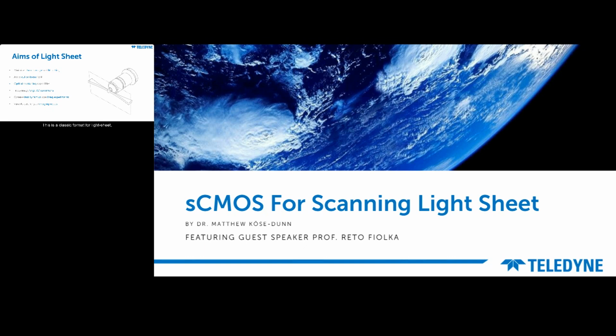This is a classic format for light sheet, but the light sheet itself can be shaped in many different ways, and the sample geometry can be changed, the angles of the detectors, the number of detectors, all sorts of things can be changed. But the focus of this webinar is the change of having not just a single static light sheet, but to have a light sheet that can be moved or scanned across the sample.